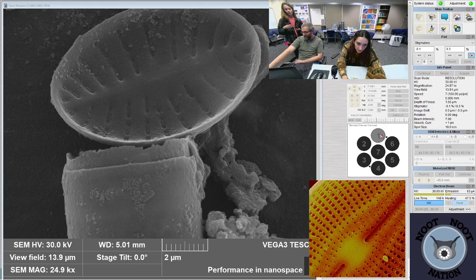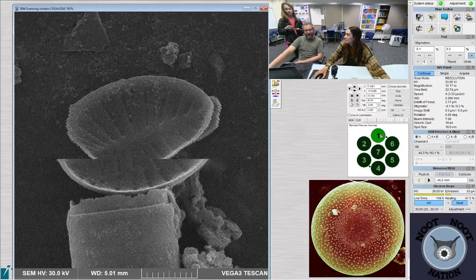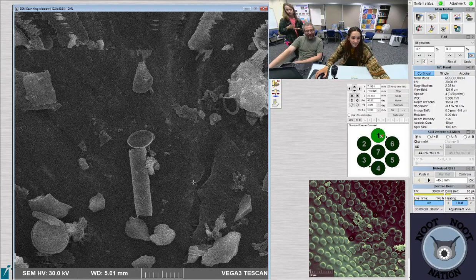What's my favorite diatom? My favorite diatom is always whatever diatom I most recently described. So Caruscus now? Caruscus is my favorite diatom. It's actually on the stream. Not right there, but earlier it was. Earlier we had a picture of it.